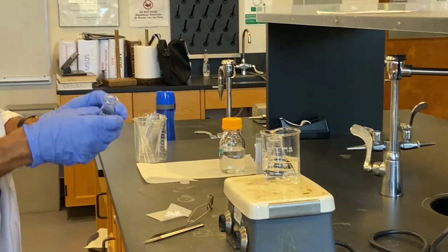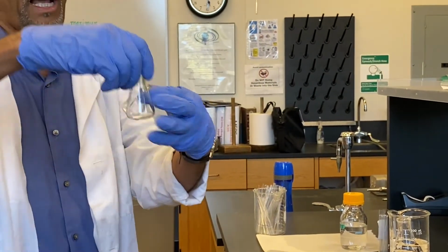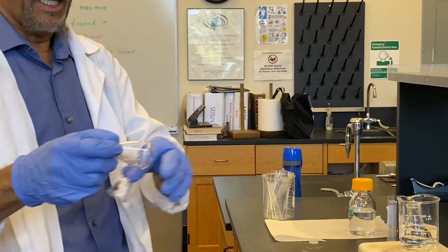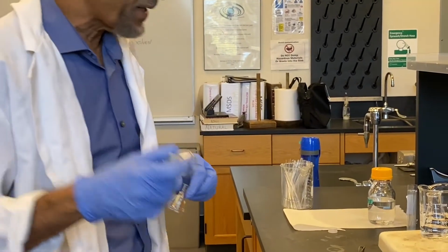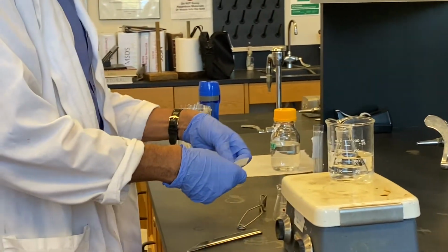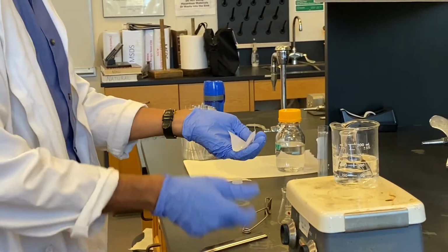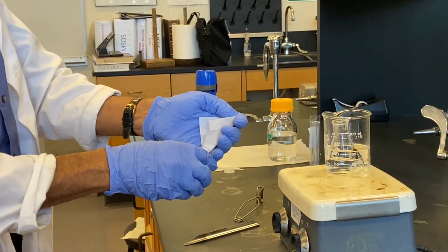So these are called Erlenmeyer flasks. They come in different sizes. The Erlenmeyer flask is good for crystallization because you can put it on the hot plate and it doesn't fall down, and also it has a narrow neck, which minimizes vaporization, right? Now I have already weighed 400 milligrams of sulfanilamide. So I'm going to transfer that into this Erlenmeyer flask.